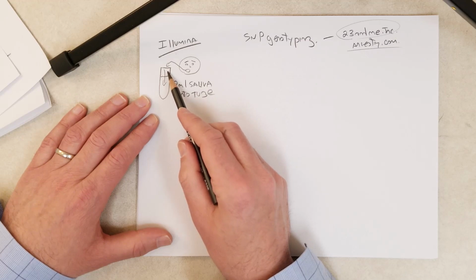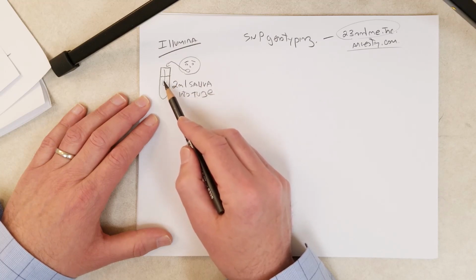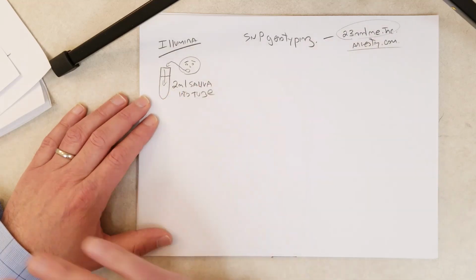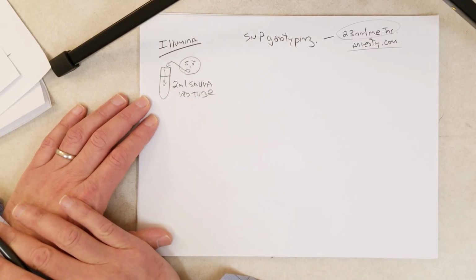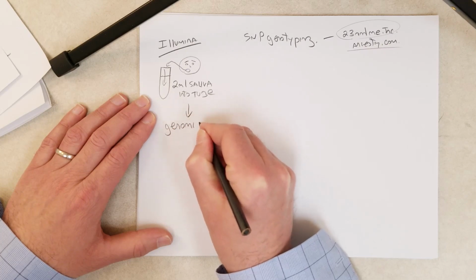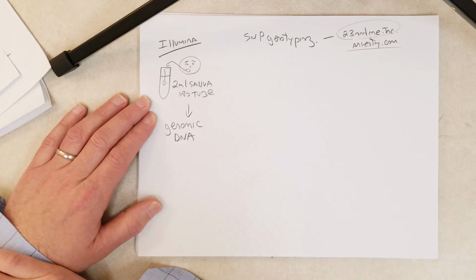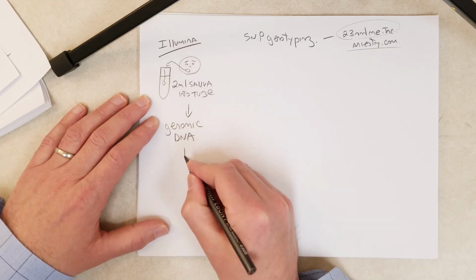When he caps it, the cap pierces and releases all of that stabilization solution, which mixes with the saliva and seals the tube tight. He drops it in the mail and sends it off to the company, whether it be 23andMe or Ancestry.com. They will harvest genomic DNA from the cells, the cheek cells or tongue cells, the small amount of cells that are in the saliva.